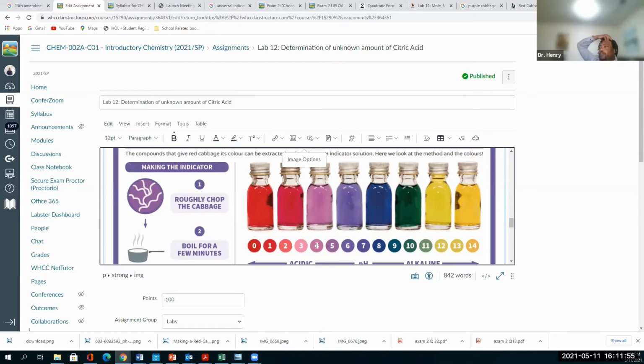Okay, so now what you're gonna do is take that conical tube, rinse out your conical tube, put water in there and put baking soda in there. Water and baking soda? And baking soda, and then add some of the cabbage to that. That's what I did, and I got dark blue, like 8. Am I test stripping this stuff too or no? Yeah, you can test strip it to verify it.